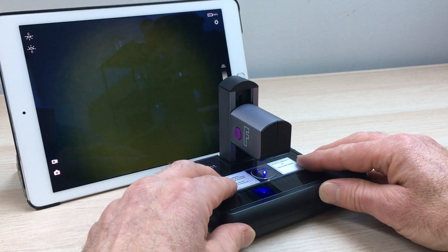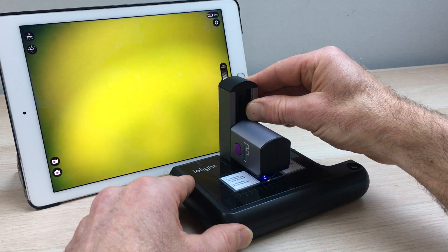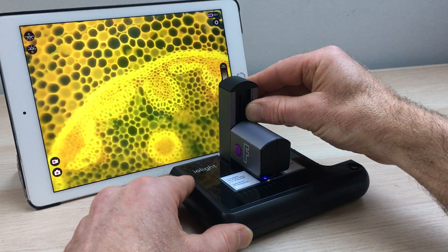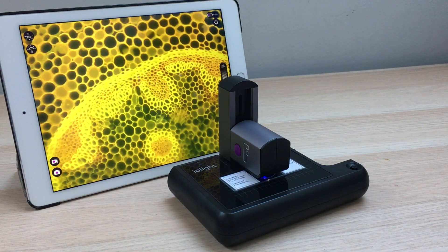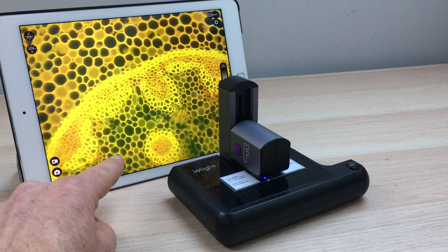If I put that underneath the microscope and then slide the head of the microscope down here to focus — there we go — we see a beautiful image of the cross-section of this plant stem, and here you can clearly see the three different dyes.